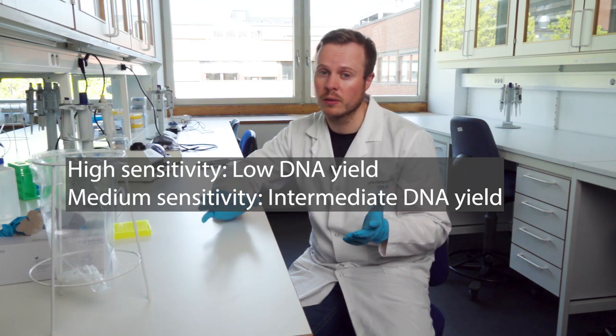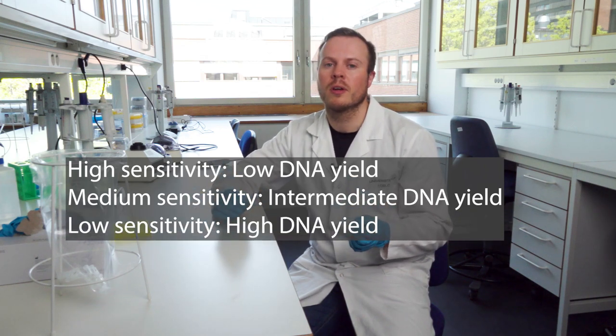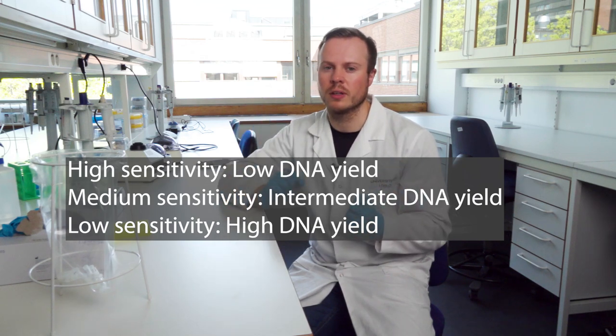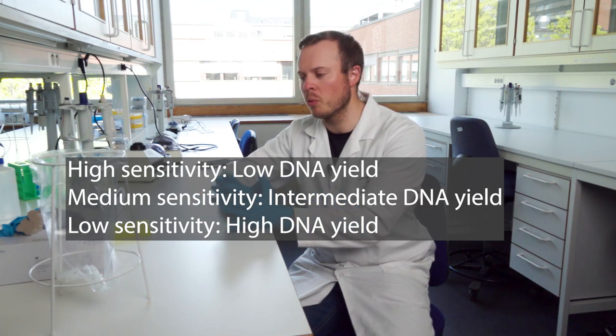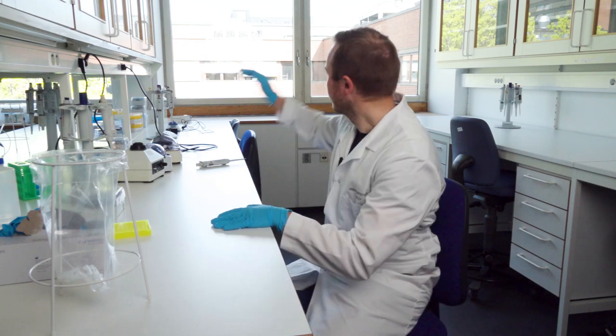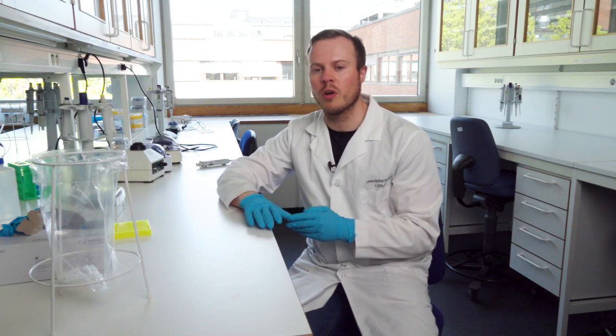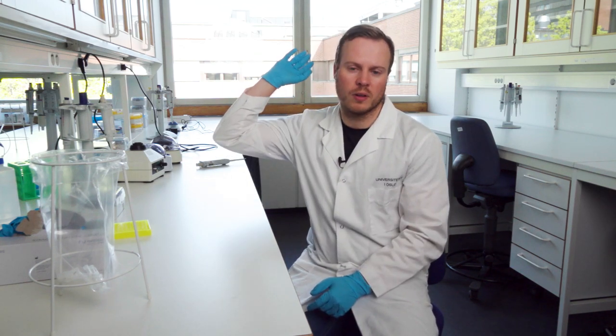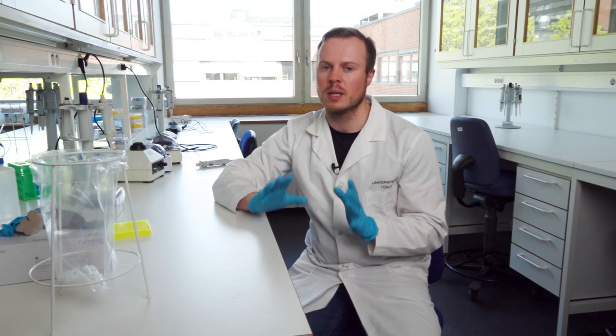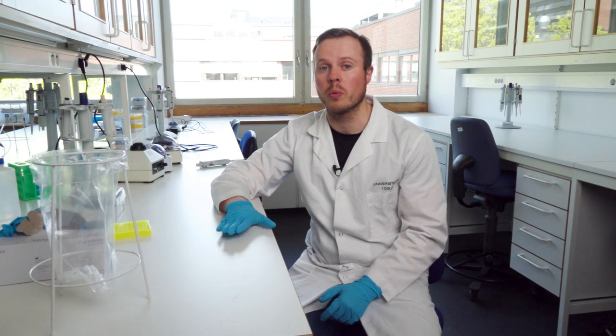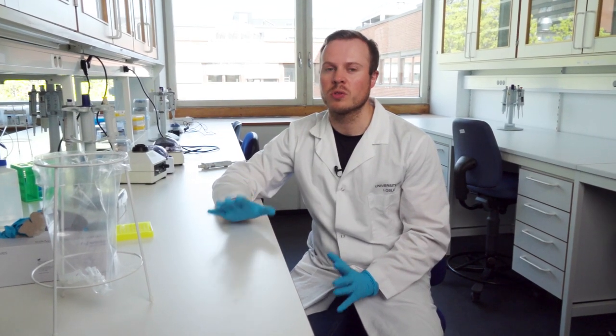So I would recommend using that. And then we have the low sensitivity that are for, for example, sediment samples and samples that are very dense with genetic material. And some key things here is that since we are working with fluorescence, light is our enemy, because sunlight or light from light bulbs or indoor lighting as well is problematic. So to do these steps in the procedure, you need to turn off the light in the room you are working with. Of course, it doesn't need to be so dark that you don't see where you are working, but you still need to turn off the light.